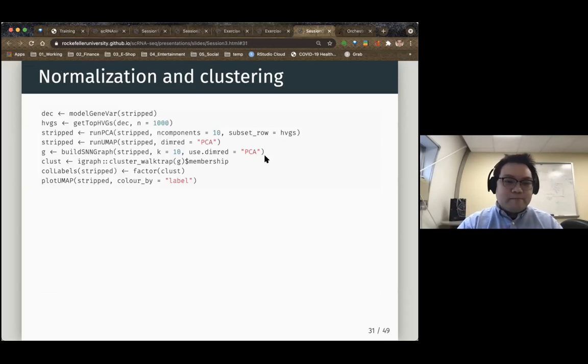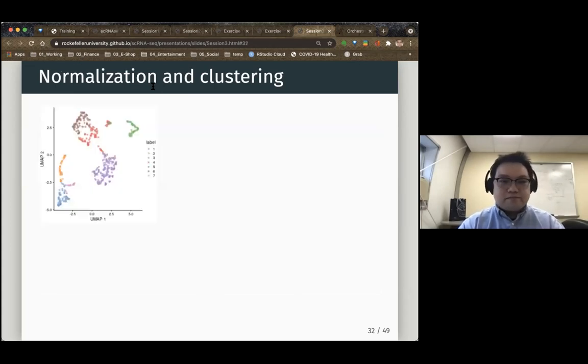That's a good sign. Since we removed something and recalculated the counting metrics, we have to rerun the normalization and the clustering again.